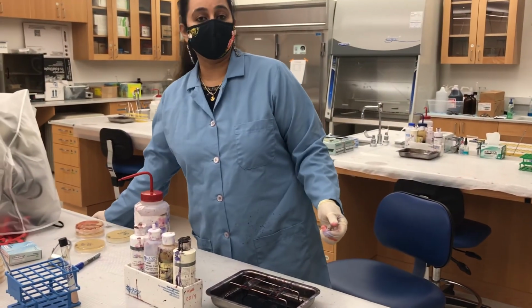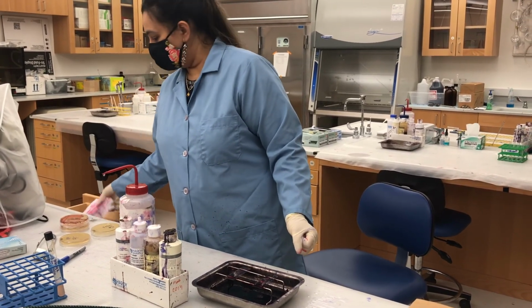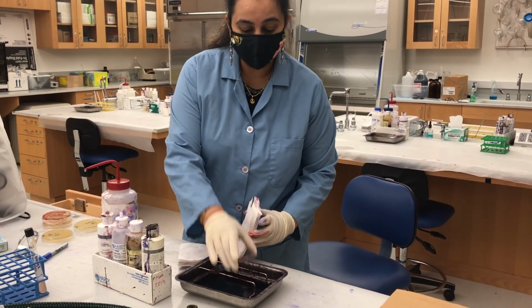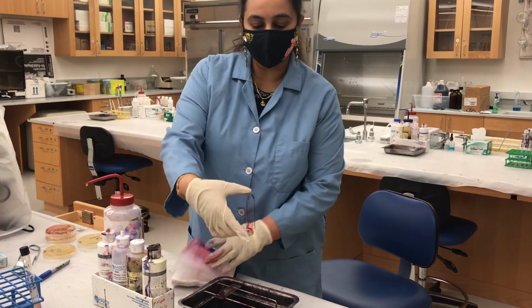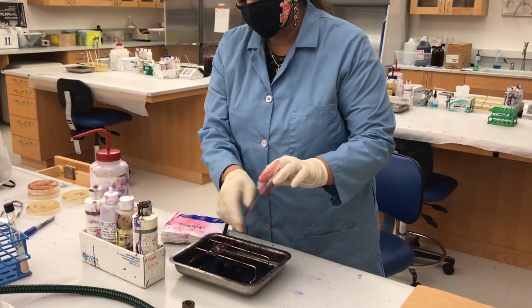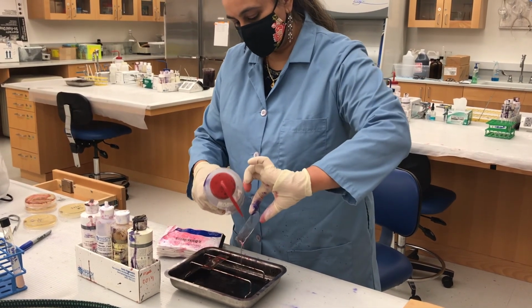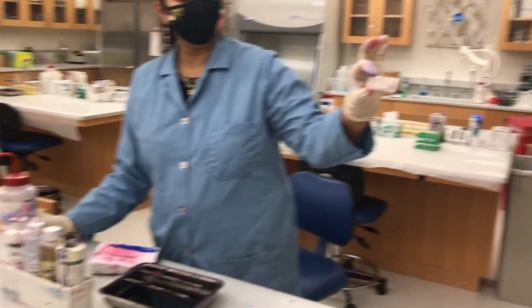The final step before your slides go onto the microscope is to dry the slide completely using the bibulous paper. This slide seems to have a little bit of dye, so I'm going to wash front and back again. So there you go.